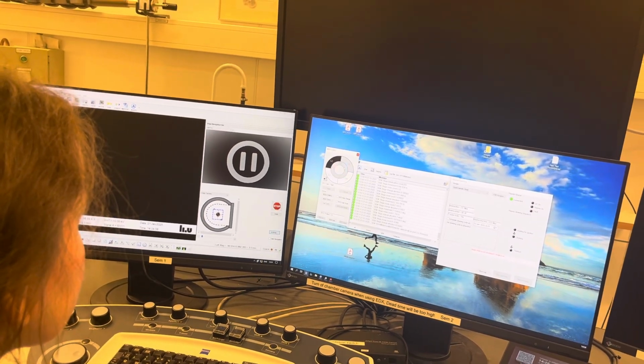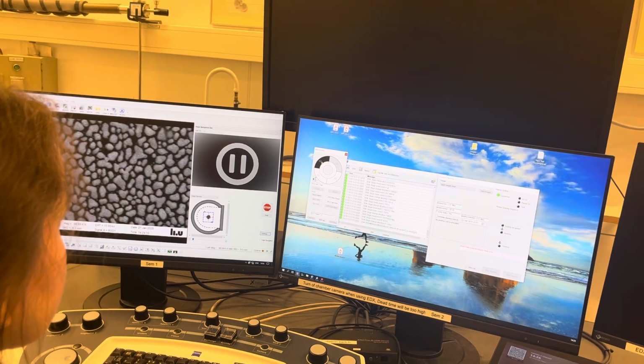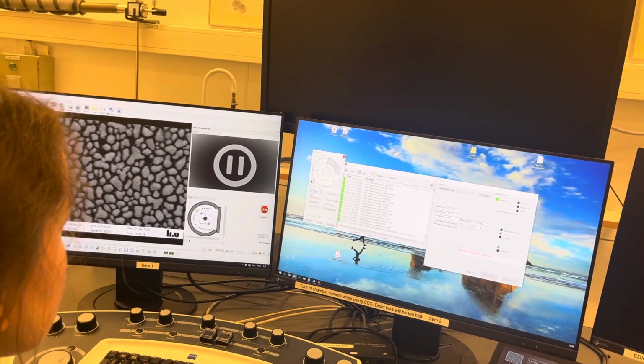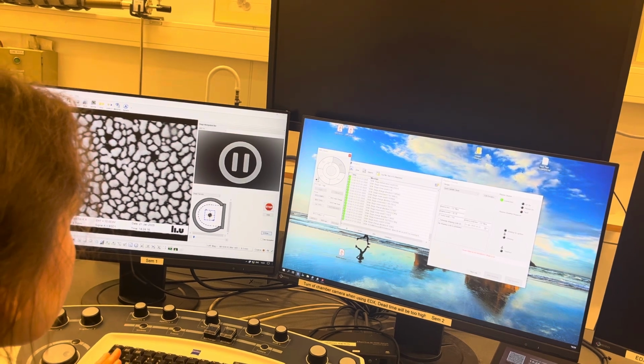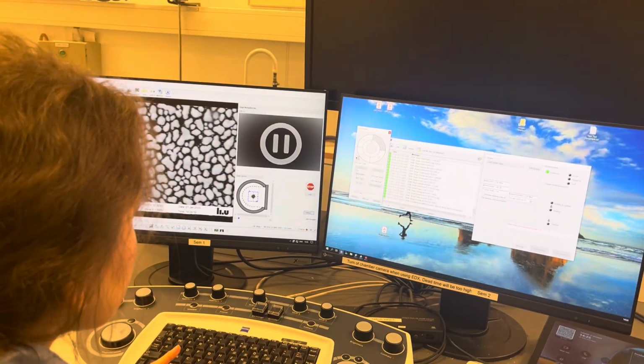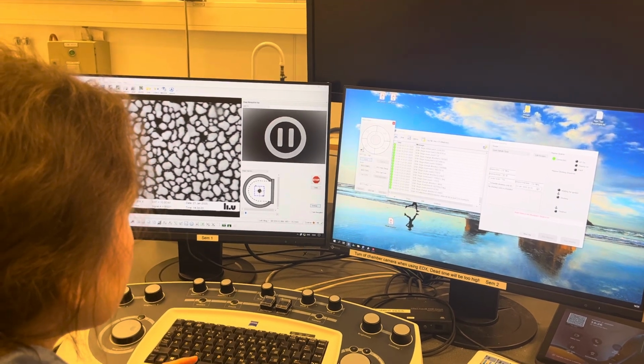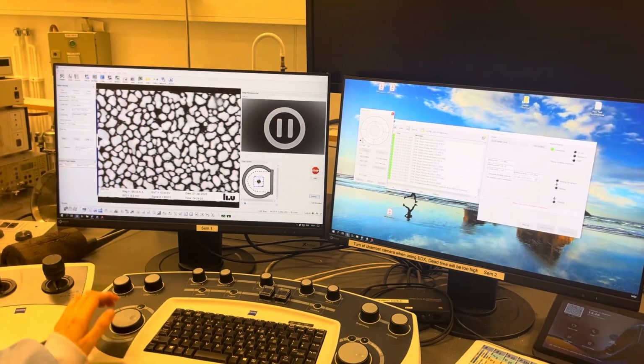Okay, it's a bit of an issue. It's not normal. So you need to click and then click very fast apply, but it should not be like this. Something is wrong with it. So anyway, so here it is.